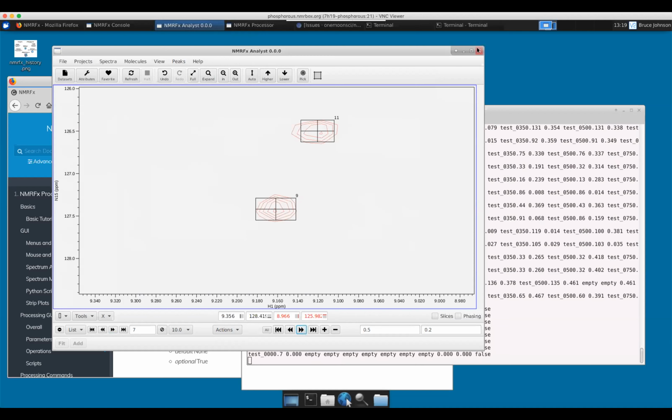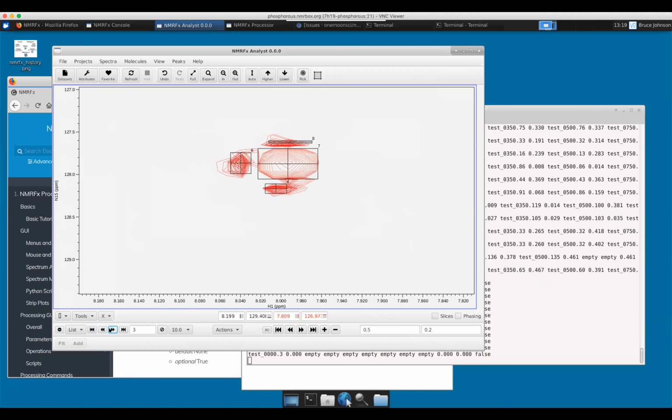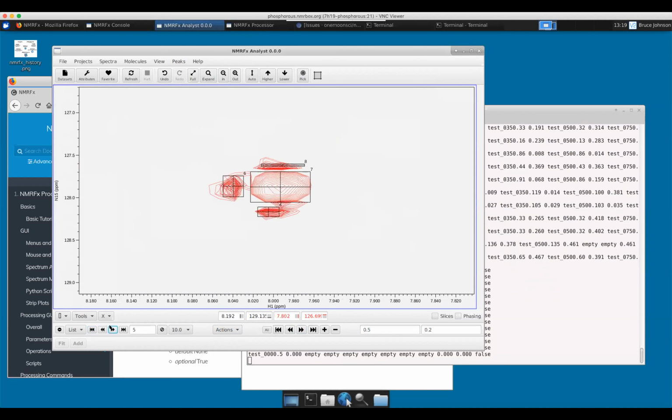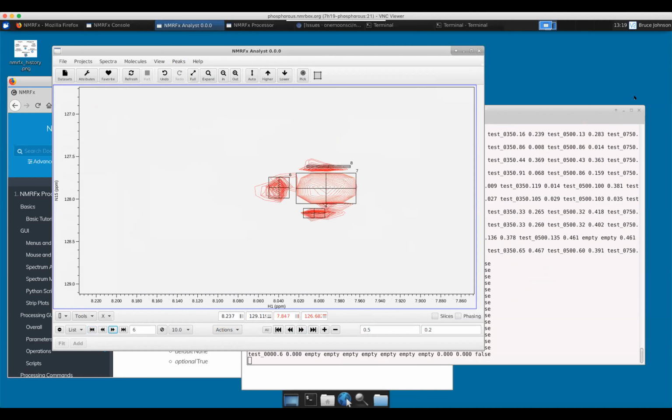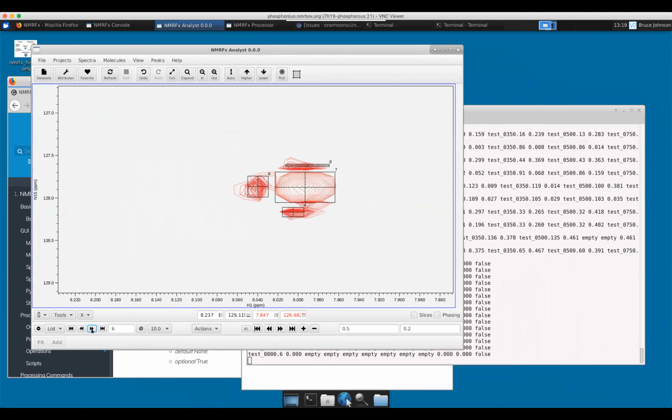And then the add button, you said, is going to add more of the peaks it is fitting, but in the lower left corner, that's like a peak navigator button. Yeah. Above the add. Yes. So this is stepping us through peaks. Okay. Basically, you step through a peak, you'll see the titration in this extra window that's not popping up. For some reason, that window's not popping up.